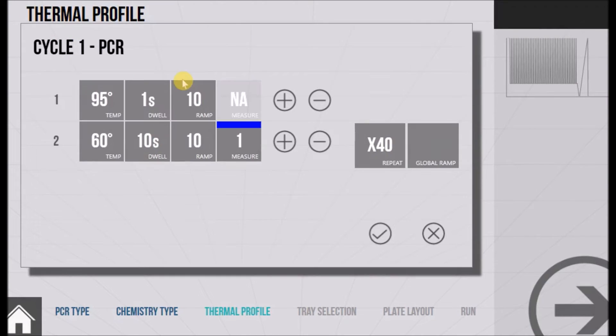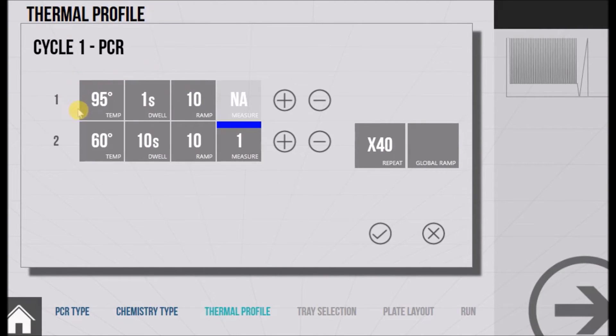If we enter our PCR section we can see our two steps. One at 95 degrees Celsius for one second using a ramp rate of 10 degrees Celsius per second, and the other at 60 degrees Celsius for 10 seconds using a ramp rate of 10 degrees Celsius per second and measuring in optical channel one. This is repeated 40 times.